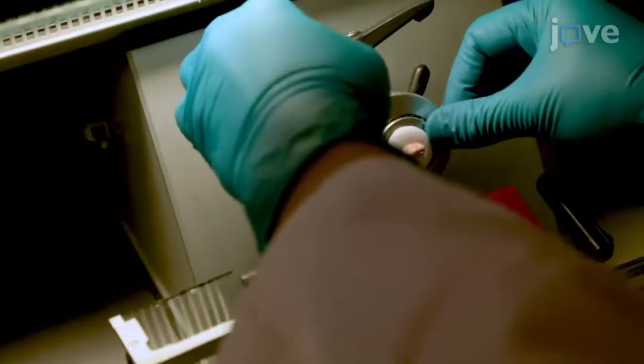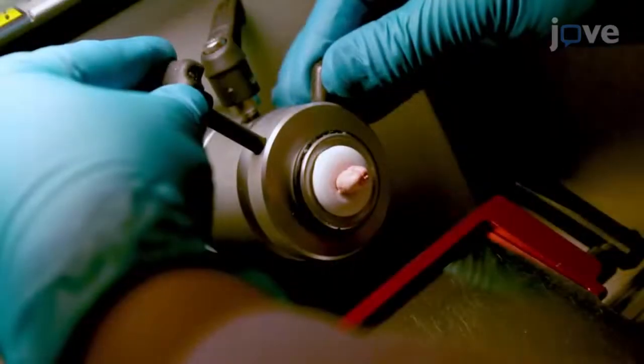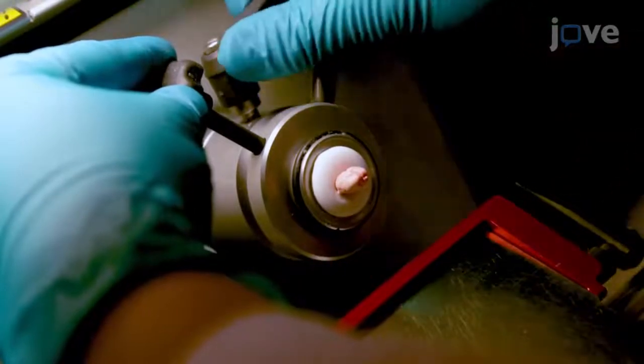Position the tissue holder in the microtome of the cryostat. Adjust the orientation of the tissue to avoid sloped sections.